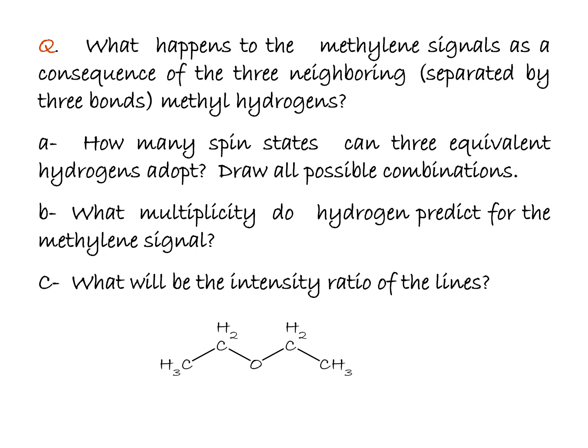But what happens to the methylene signals as a consequence of the 3 neighboring methyl protons? How many spin states can 3 equivalent hydrogens adopt? Draw all possible combinations.